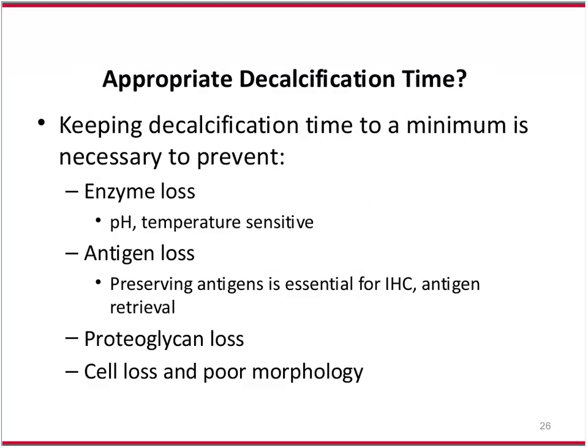So again, should I keep this at 4 degrees and change the solutions often and keep this a slow process, or keep it to a minimal amount of time for decalcifying? And the longer that your sample sits in a decalcifying agent, the worse results you'll have with proteoglycans.